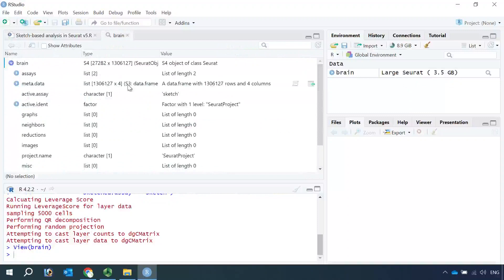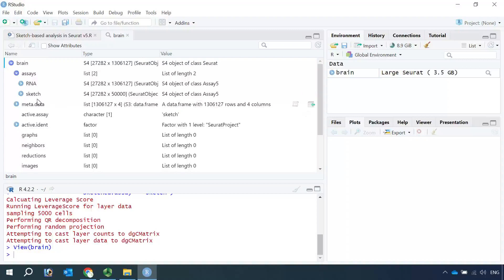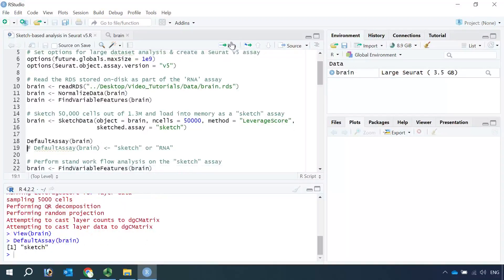You can see the object now has two assays: one is RNA, the other one is sketch. The sketched assay only has 50,000 cells. We will use the sketched assay to perform the standard workflow analysis. At the moment, the default assay should be sketch. If you are not sure, we can check it using DefaultAssay(brain). You can see the default assay is sketch. We can use the default assay function to switch our analysis between the sketch assay and RNA assay.